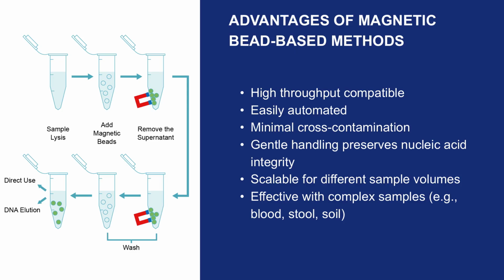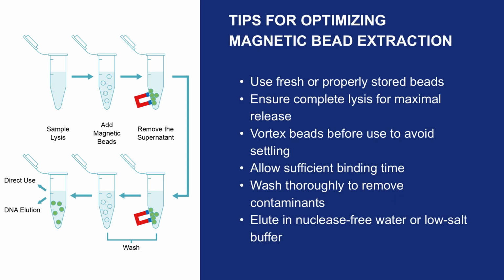Next, I'll share some useful tips to get the best performance out of magnetic bead-based extractions. To maximize your yield and purity with magnetic beads, make sure the beads are well resuspended before use. Ensure complete lysis of your sample.